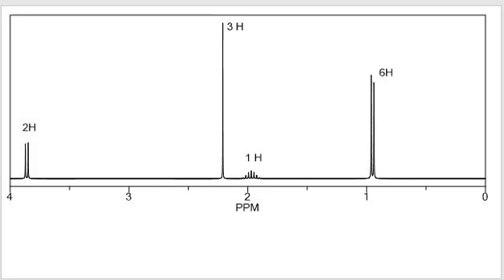So the first thing that we're going to do is gather the information that we can from the molecular formula or other information. If you have the IR, it's also helpful to refer to that. Maybe mass spec is also useful to you. So make sure that you use all of the data that you have available to you in your structure determination. It will make your task simpler, and also the final structure does have to be consistent with all of that data. So we know the formula for this molecule, perhaps from the mass spec or something that allowed us to figure out the formula.